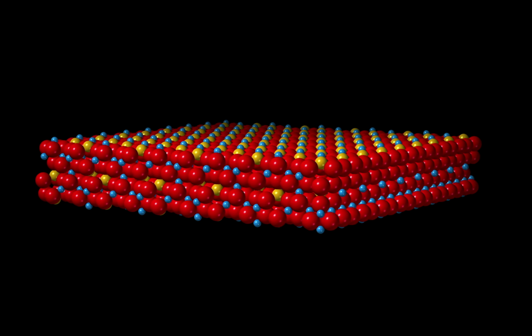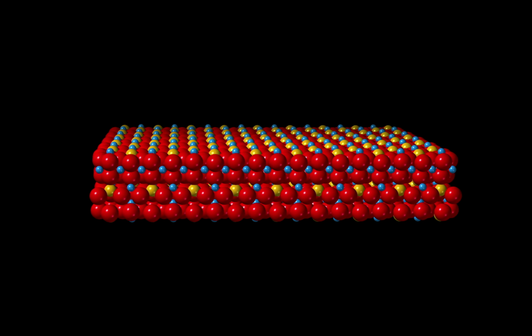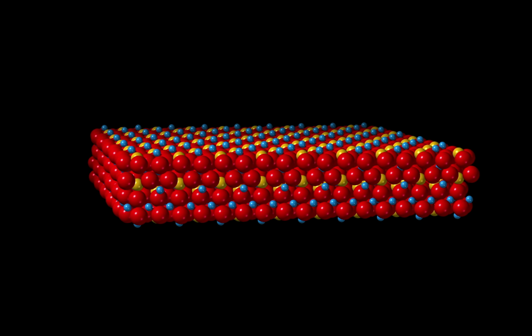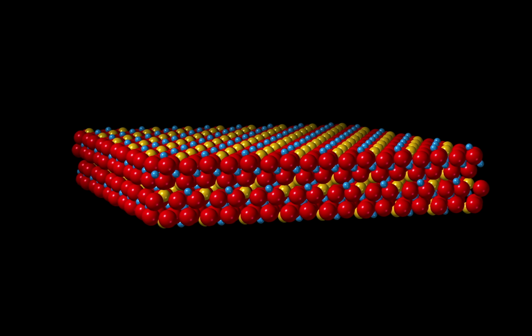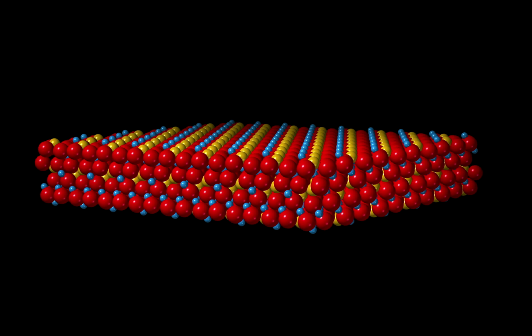So that's a quick look at the slab automation introduced in CrystalMaker 11.6. We were able to instantly generate a parallel-sided slab in our chosen orientation and with our specified diameter and thickness. And we then used the planes inspector to interactively change the slab thickness.